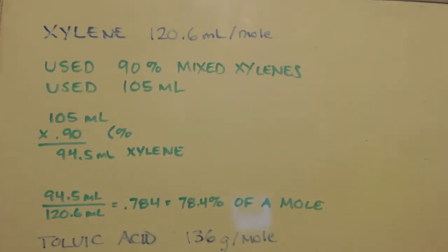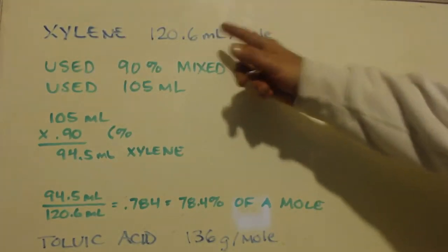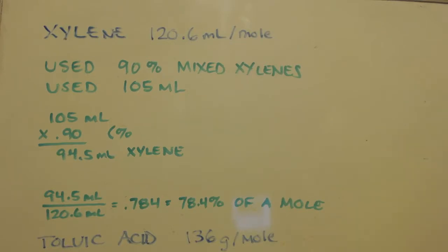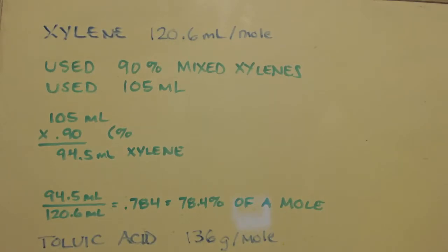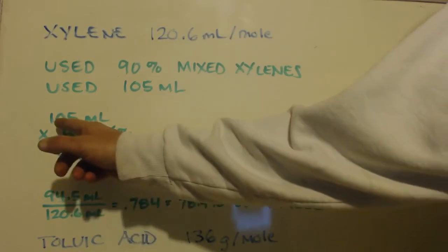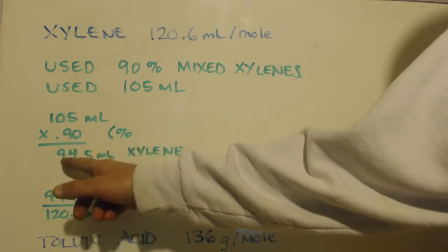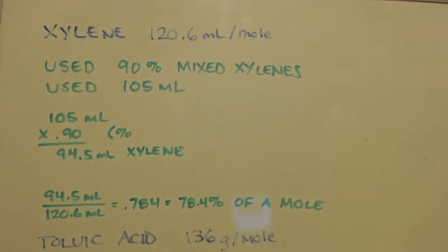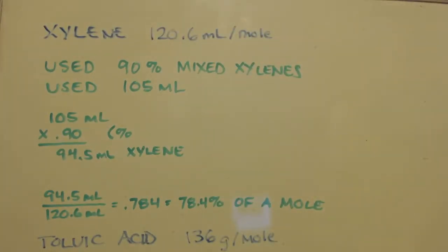So here's xylene. Okay, this is 120 milliliters per mole. Every mole, 120 milliliters is a mole. I use 90% mixed xylenes. I used 105 milliliters only because I didn't have 120. I miscalculated there a little bit. So I take 0.9 times 105. I used 105, but only 90% of it was xylenes. So 94.5 milliliters was how many xylenes was inside the amount that I used.